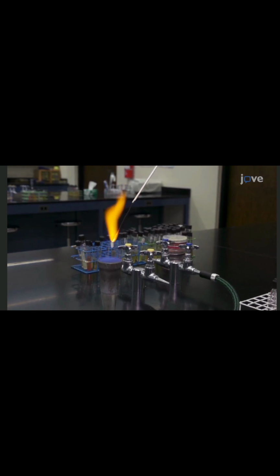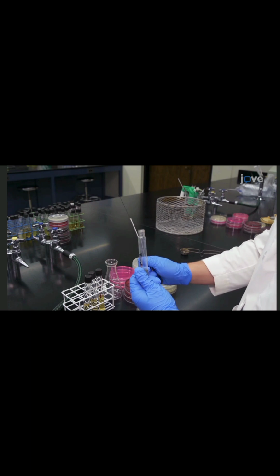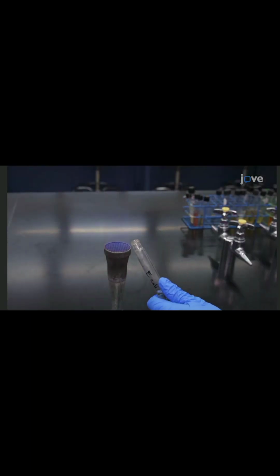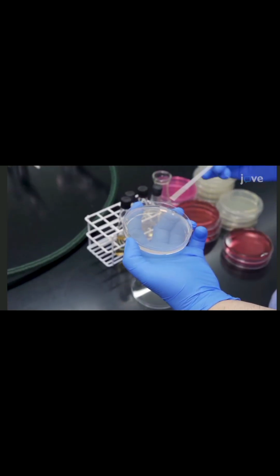With your free hand, pick up the inoculating loop and then sterilize it in the flame of the burner until it glows orange for a couple of seconds. Allow the loop to cool in the air. Then open the broth culture tube and quickly flame the opening. Dip the loop into the culture, and then streak the organism onto the first quadrant of the first plate.